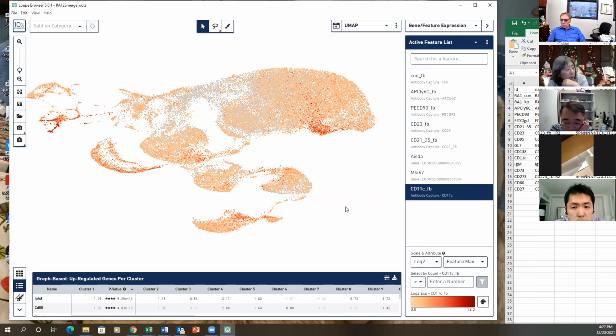I think this did work. Right, I can confirm this works very well. So CD11C, what's the purpose here? The purpose was the same, because the ITGAX doesn't show up well. Let's say we do ITGAX.